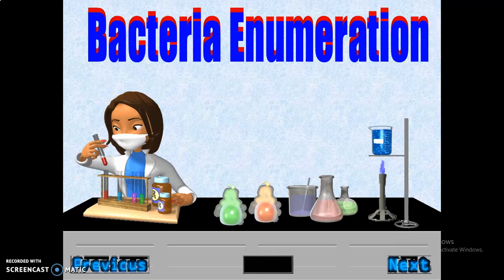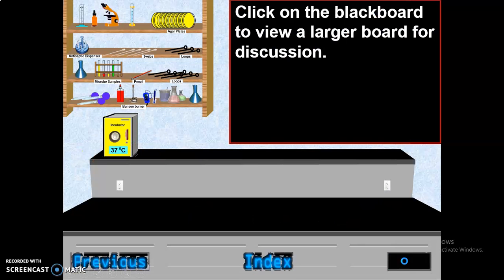Today I am going to do a lab simulation based on bacteria enumeration. Let's go to the experiment. Click on the blackboard to view a larger board for discussion.